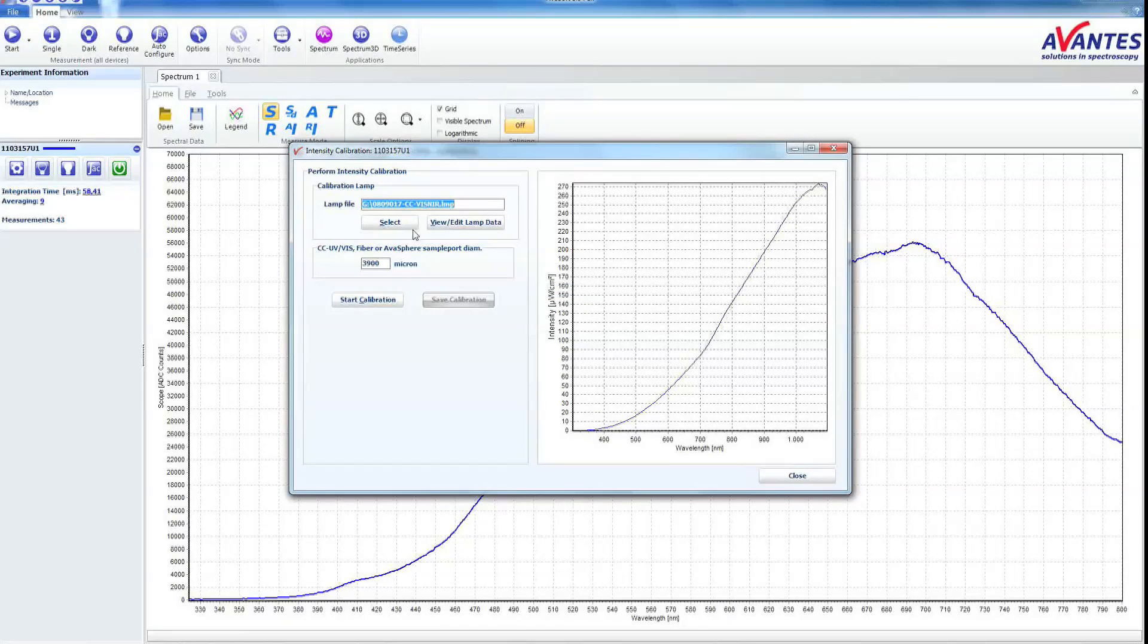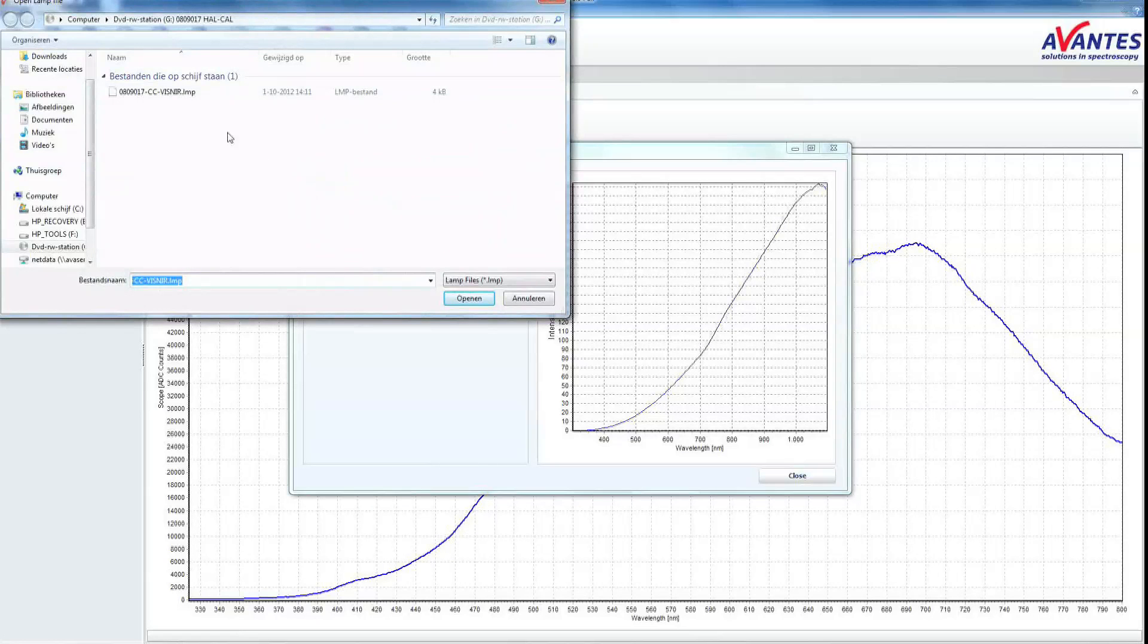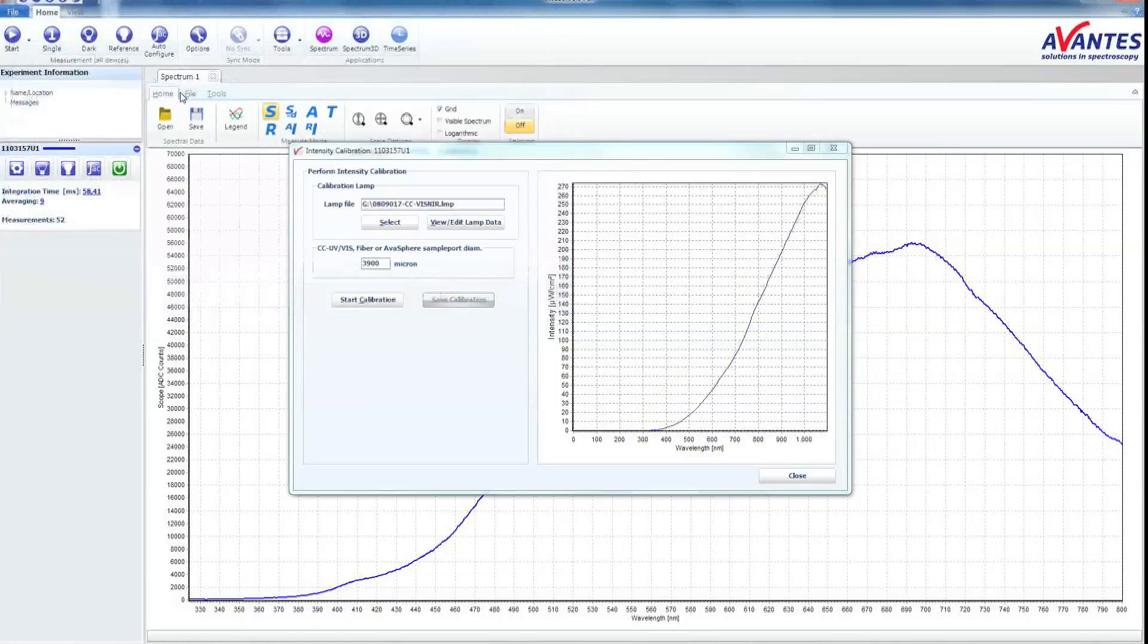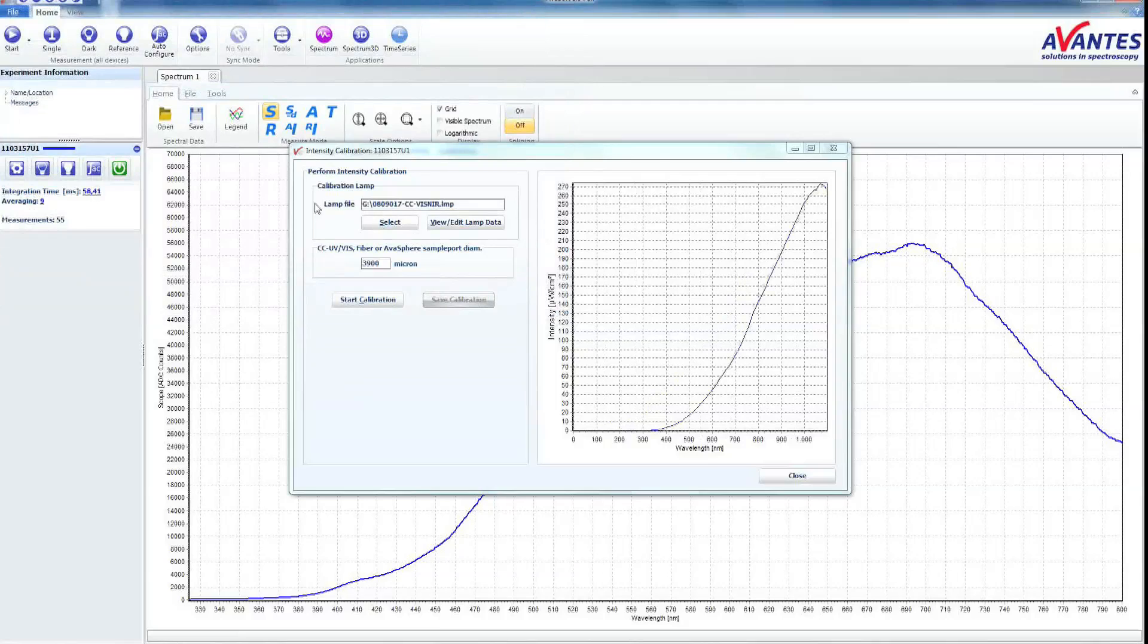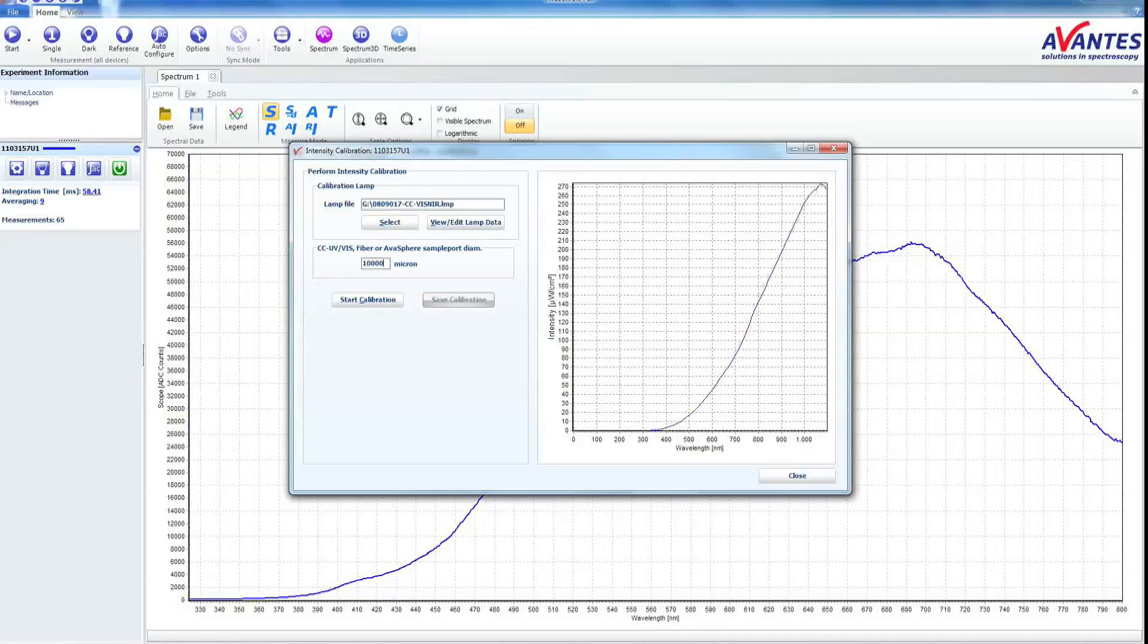Select the lamp file which is stored in the supplied CD-ROM. Enter the diameter of the detection surface of the sphere or the cosine corrector. Click the Start Calibration button.